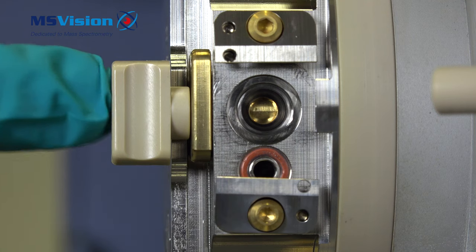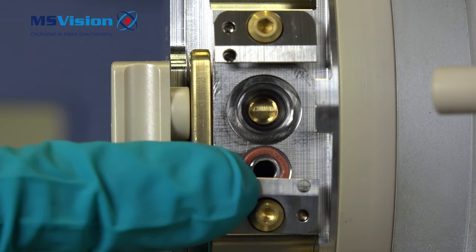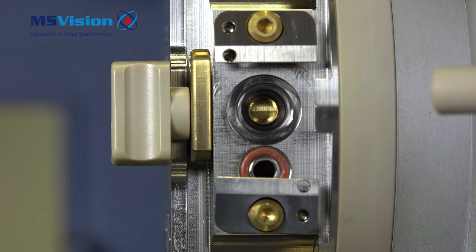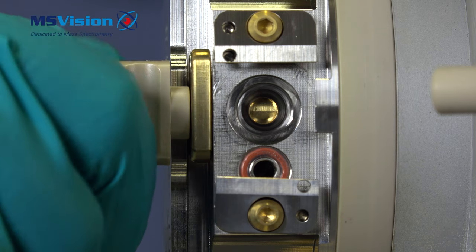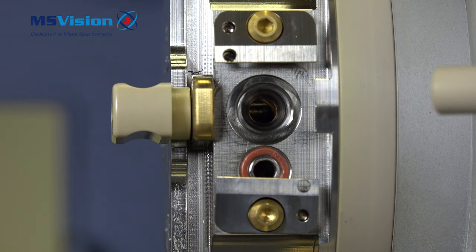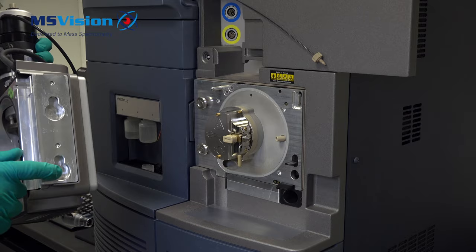You can see the isolation valve here is closed. This closes off the vacuum so that you can remove the cone after cleaning without venting the system. In this position you can see it's fully open. Do not do this when the system is under vacuum because your turbo pumps will be heavily stressed and may become damaged.